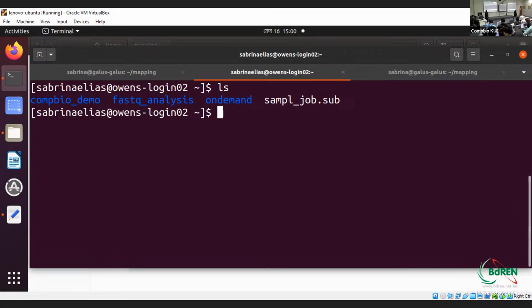Let's see, where are we? Okay, so all of you are in OSC right now, right? So create a directory named mapping. If you have it, then it's fine. If you don't have it, then create a directory named mapping using this command.